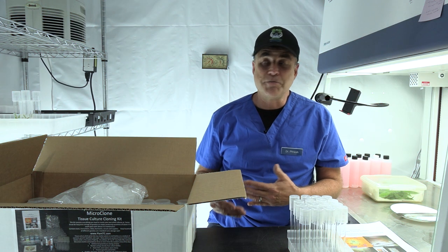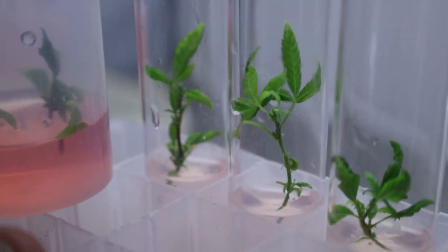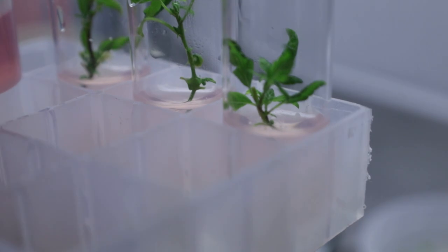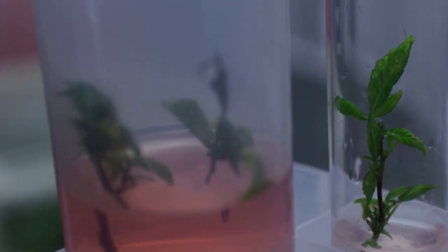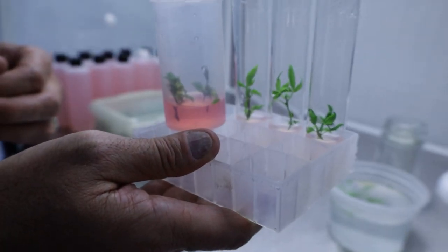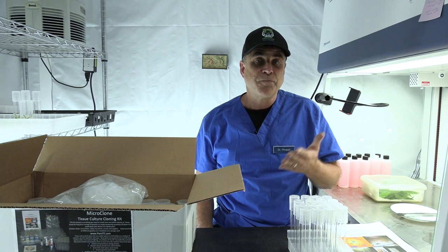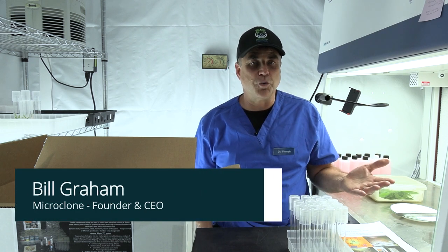Tissue culture is basically growing small plants that would be too small to root on their own, and we do that by putting them on a liquid media made with nutrients, agar to hold it together, hormones to give it a direction to grow — that's either going to be towards rooting or towards branching — and sugar. Sugar is what makes tissue culture work.